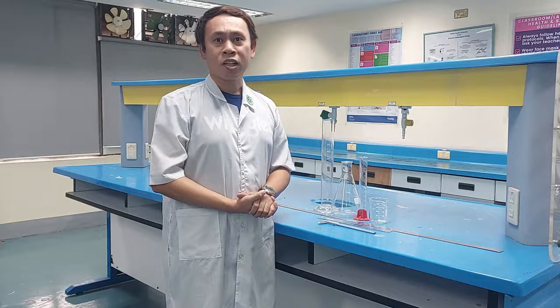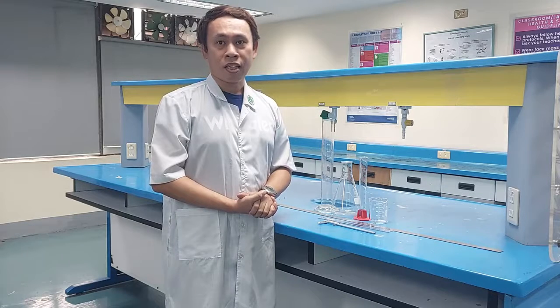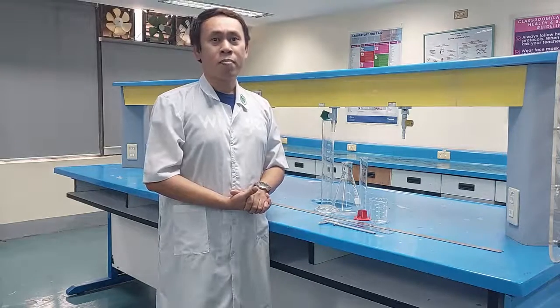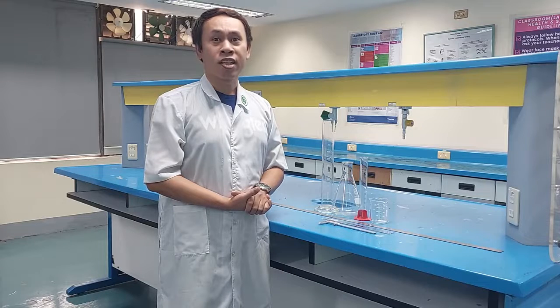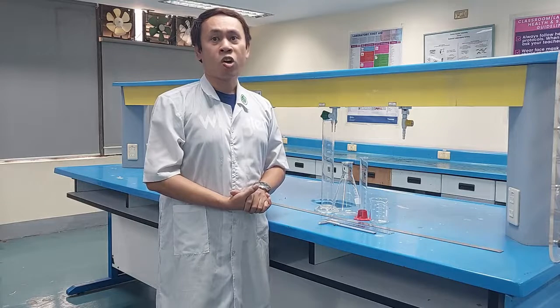Throughout the student's undergraduate career, you will be asked numerous times to measure the length, mass, and volume of an object. Thus, familiarity with devices routinely used to measure mass and volume is essential for the successful completion of a number of laboratory exercises. Length may be measured with a metric ruler using SI units such as millimeters and centimeters.